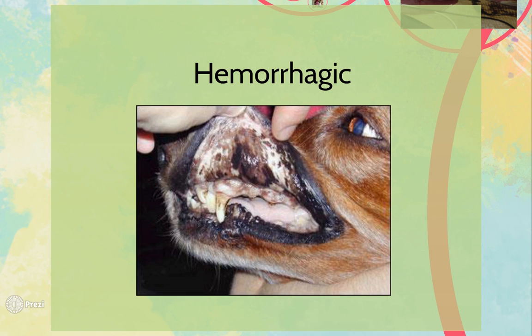and unfortunately they can bleed out. So what you might find on cytological analysis are macrophages with hematoidin or hemosiderin inside the cytoplasm. You can just see hematoidin and hemosiderin kicking around on its own, and that's the big yellow crystals, and then hemosiderin's black or darker granules, sometimes brown, just kicking around. Predominantly you'll see RBCs, and then of course some activated macrophages displaying erythrophagocytosis and no platelets. That's key.